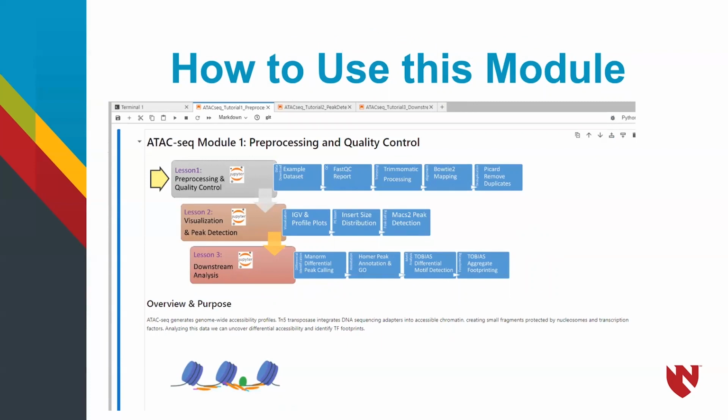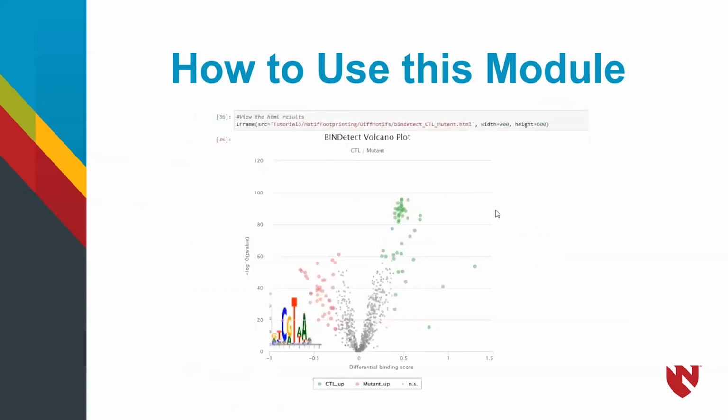The steps are implemented in Jupyter Notebooks organized into blocks of code and markdown comments. To run the code, click on a section and select the Run button at the top. These lessons also contain quizzes, flashcards, and HTML reports that can be interacted with by clicking on them.